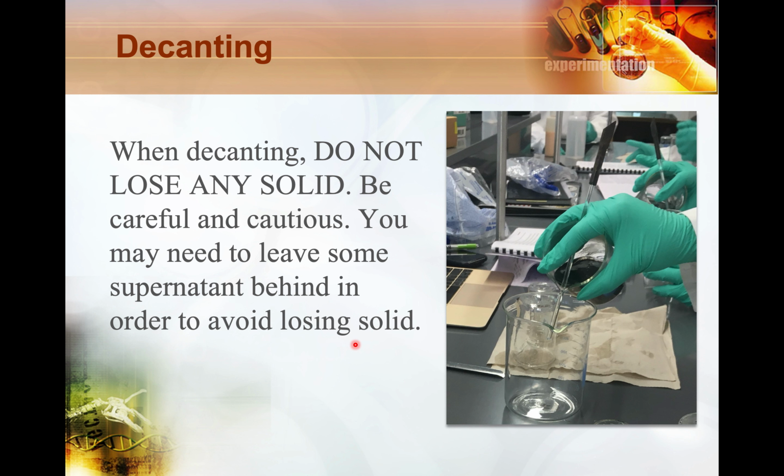After it's reacted, remember, we're going to be decanting things. You have to be very careful not to lose any solid. This won't be quite the same as the zinc iodide, where it was pretty sticky and stuck to the sides. You're going to have some solids that are going to be much more free-flowing, and this is much more of a worry that you're going to lose solid in the decanting process. So be very slow, be very careful, and be very cautious you don't lose any material. It's better to leave some supernatant behind than to lose solid, because you'll be doing rinses, and it's okay if you leave some liquid behind, but definitely don't lose any solid.